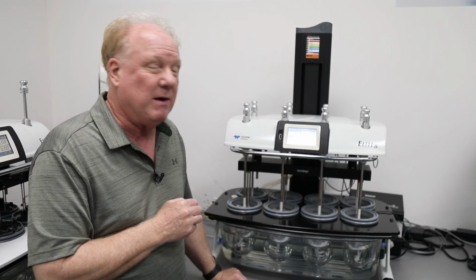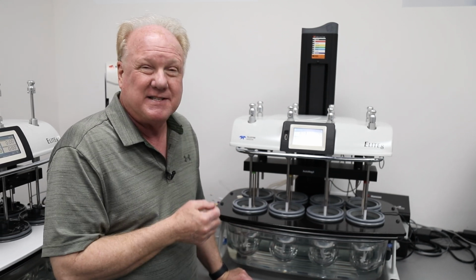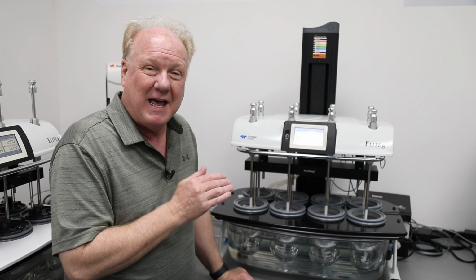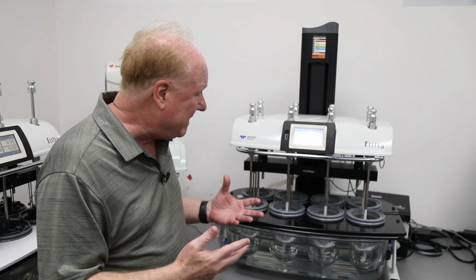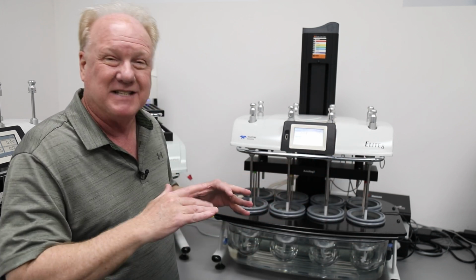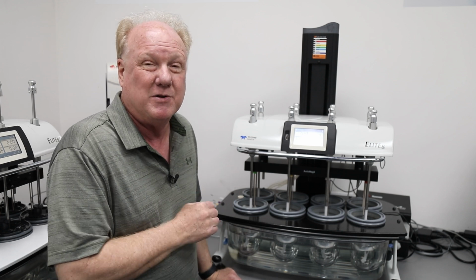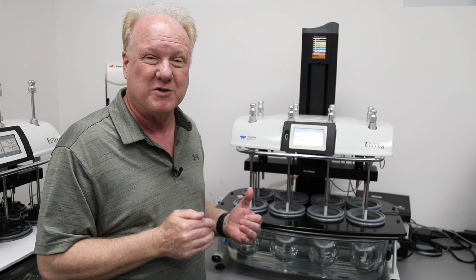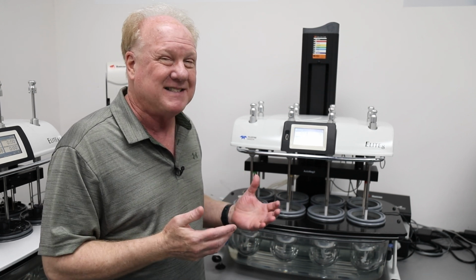When we prepare our media, we want to make sure that we are effectively degassing. However, as chemists, we understand that degas can be difficult to affect and maintain. Once we stop the degas procedure, the media immediately begins to re-aerate from the environment. So that level of degas is always changing, so it makes it a parameter that's difficult for us to reproduce and control. The level of degas that we want to attain is a level which won't interfere with our analytical analysis. Well, what exactly is that level?